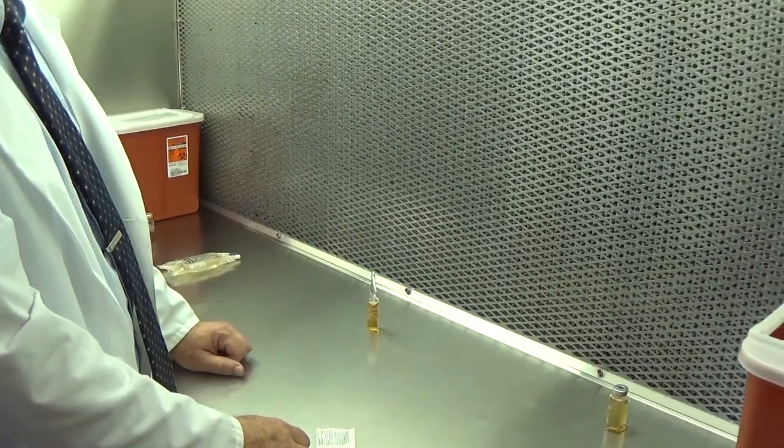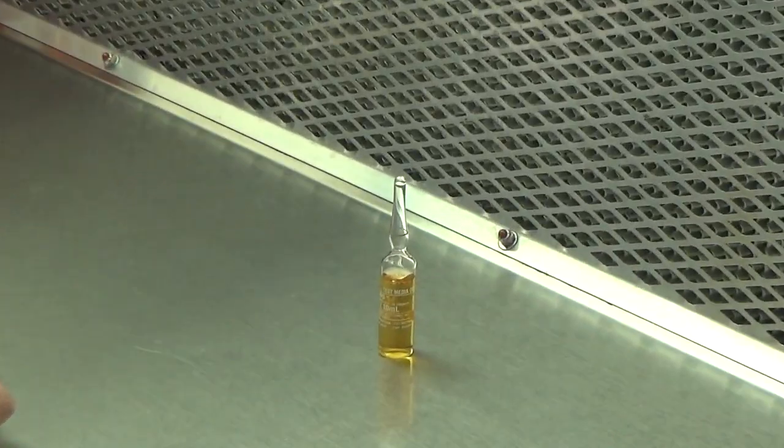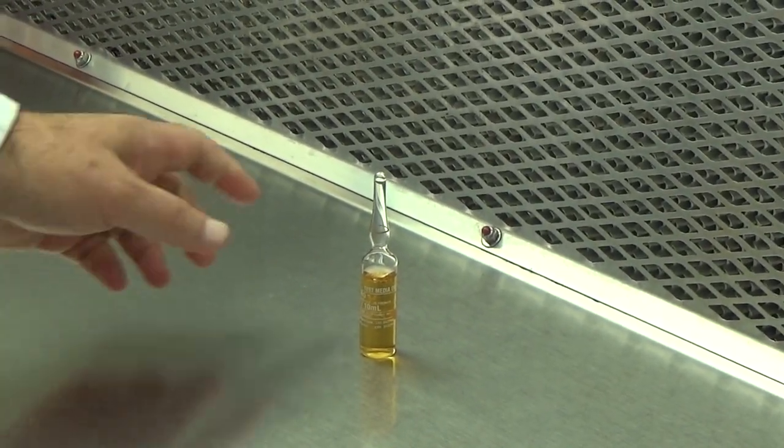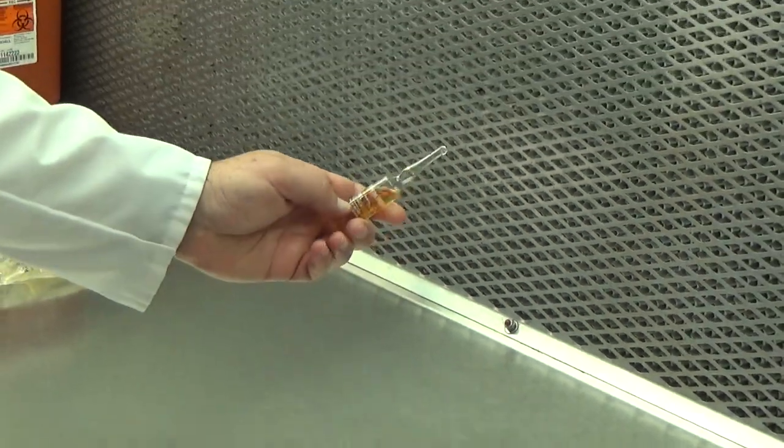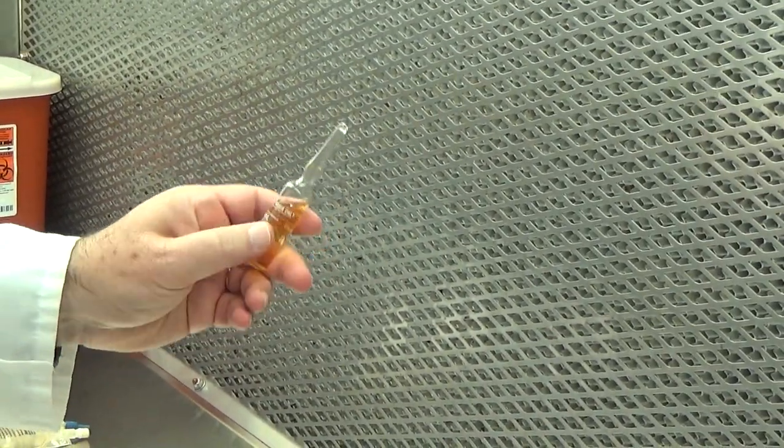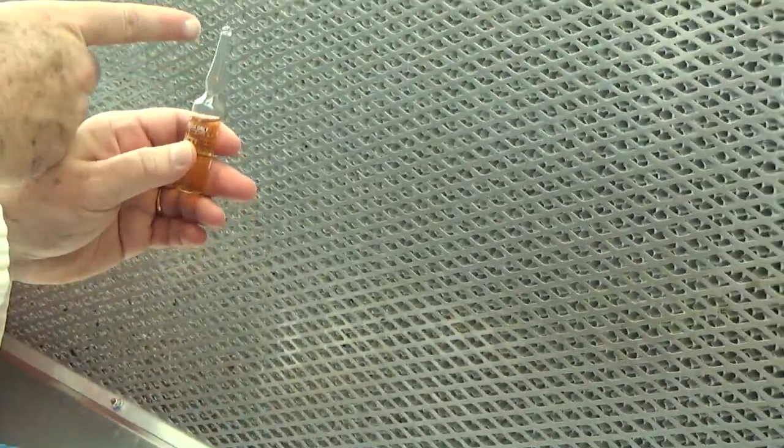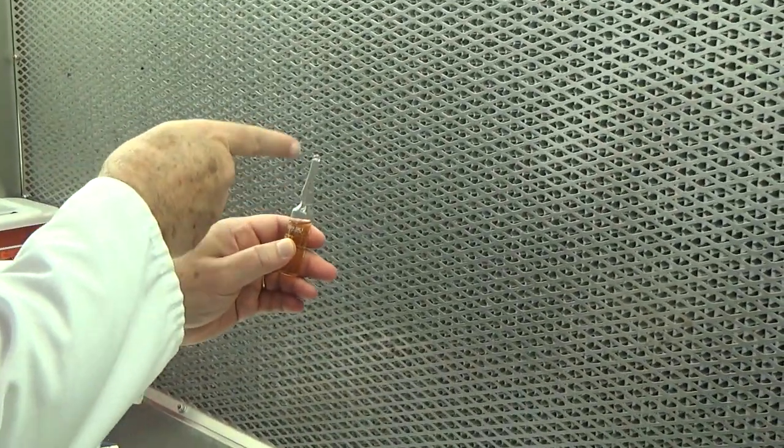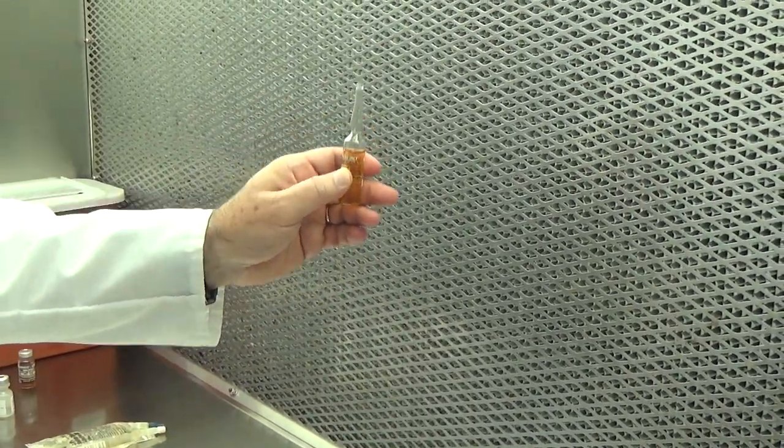Now I'm going to demonstrate the proper techniques for opening and transferring the contents of an ampule. The first step is the same as with any additive. I'm going to check the identity, strength, concentration, and expiration date. The second step is remove any residual drug from the neck of the ampule, which it's already gone.